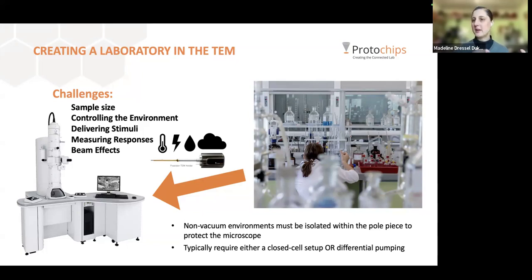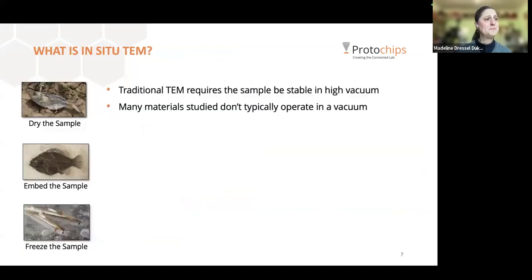So at this point, I'm going to transition. We're just going to talk about liquid TEM. That's when we take a sample that's in liquid, and we put that into one of these dedicated sample holders, and we do our experiment in the microscope.